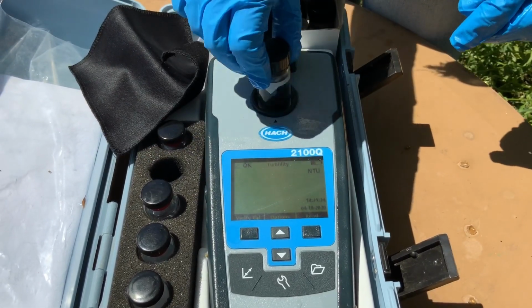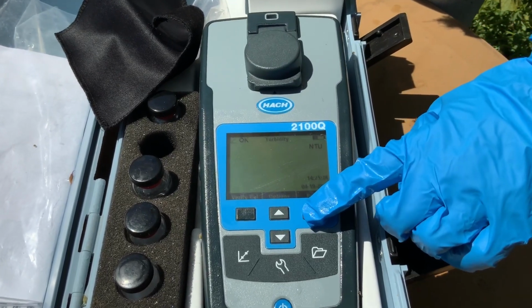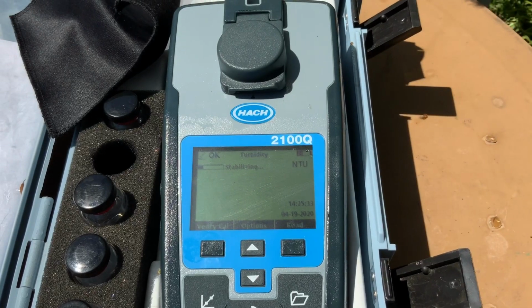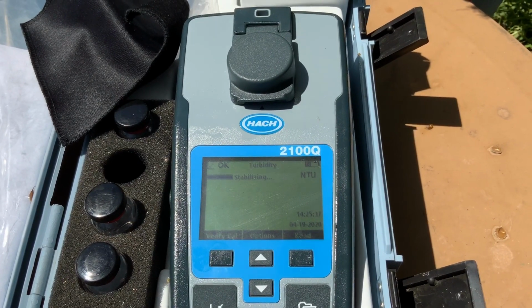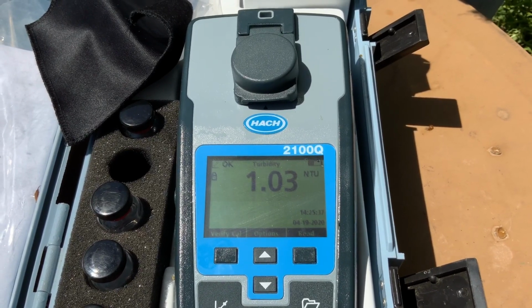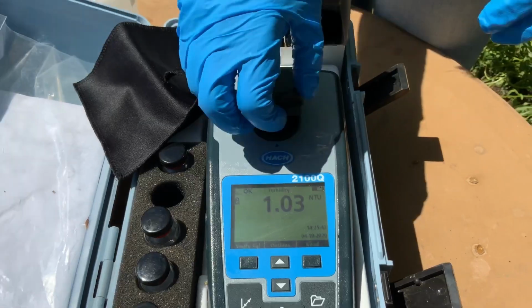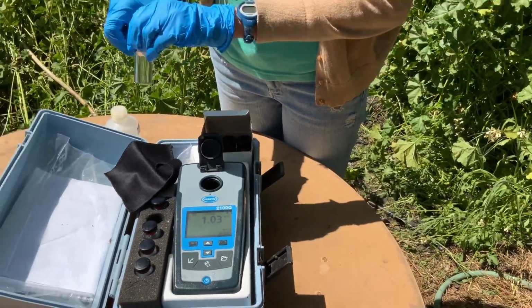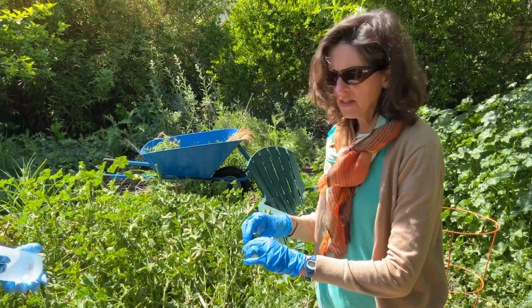All right, so now we're ready to read. Stick this in here and we'll press read this time. So not verify cal, we're just gonna press read because we already calibrated it. Okay, and so it'll go stabilizing and it says 1.03. So 1.03 would be what we read for our turbidity. It was nice and clear water up there. Should we try one more? Yeah. So we would usually do this a couple times.